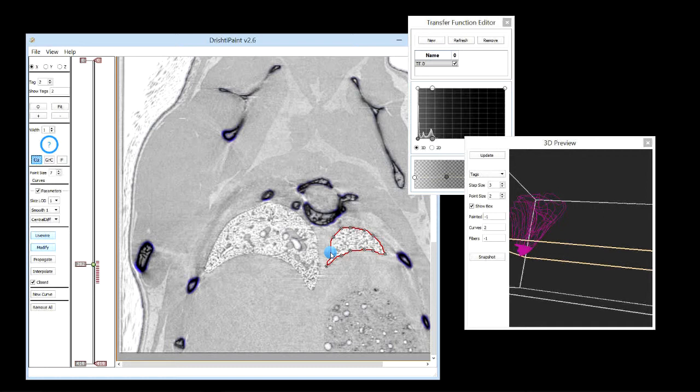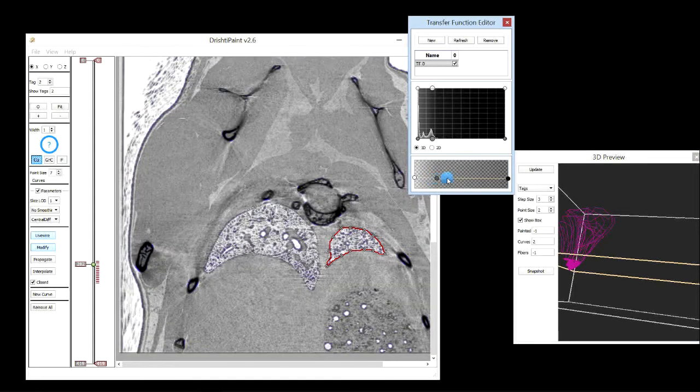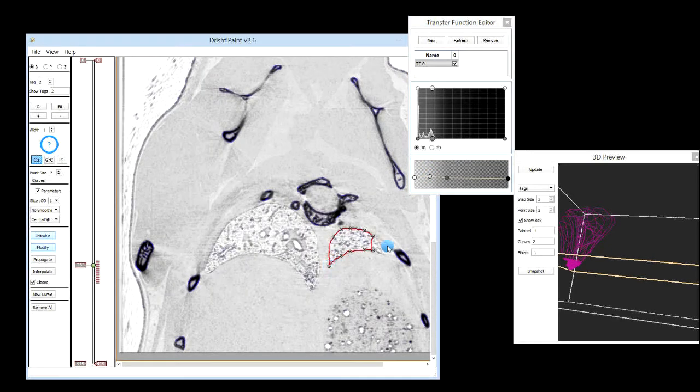You can also add a point. Use shift left click to add a point. So I've added a point here. Maybe I should turn off the smoothing and then modify here. No, it doesn't work. So smoothing is... move here.